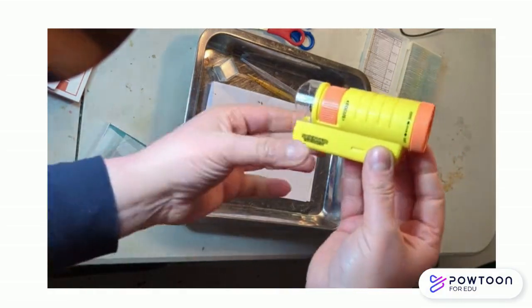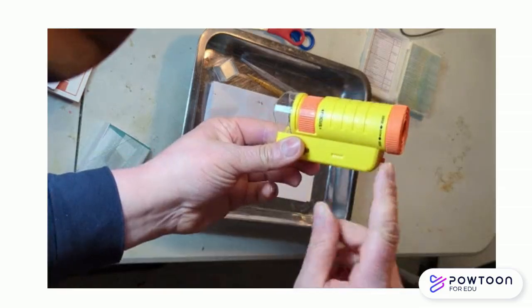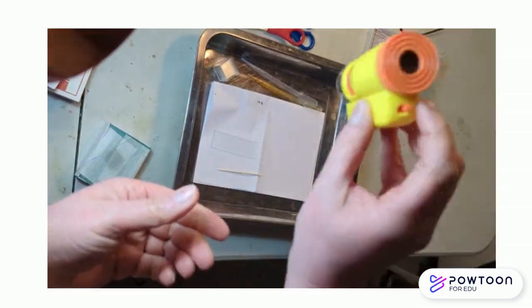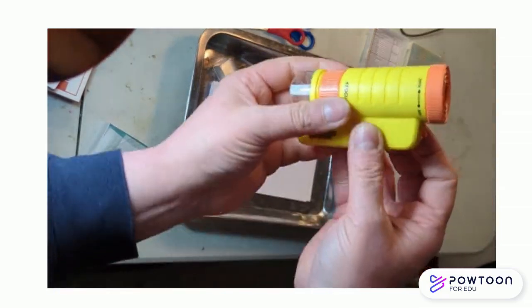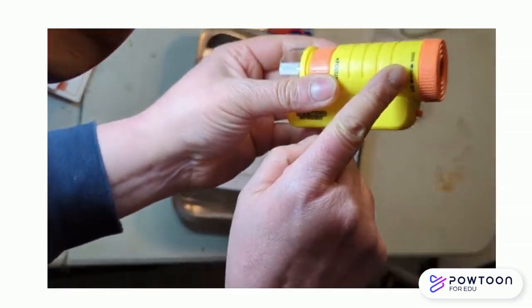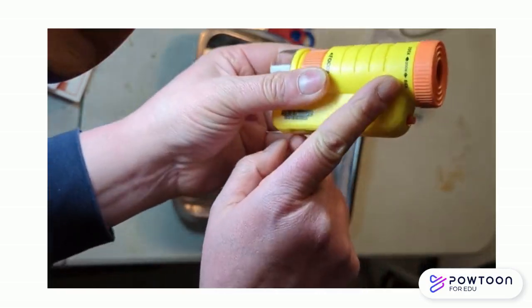When you explain to your students how to use it, even if they've got it at home, remember, the first thing you need to tell them is that there are two factors, only two factors. Magnification, how big you make it. And here it's quite clear. You see 200 to 60.